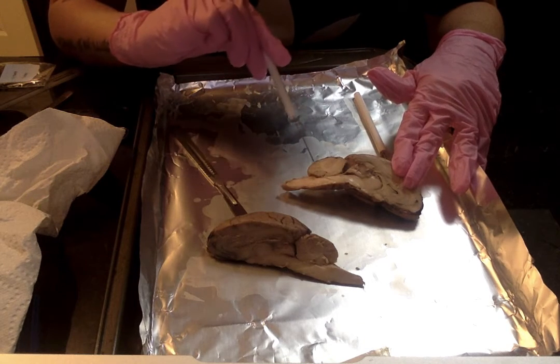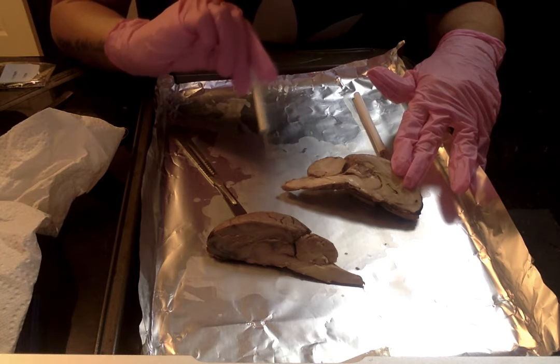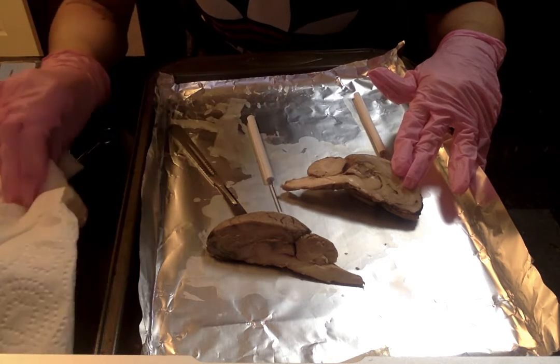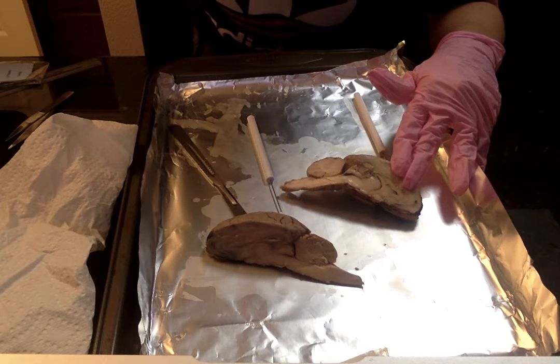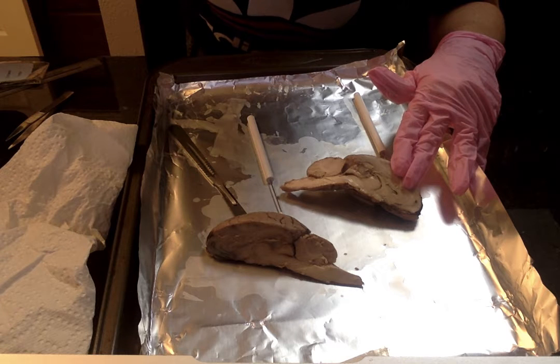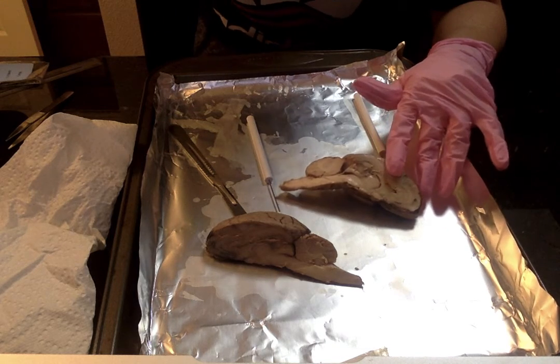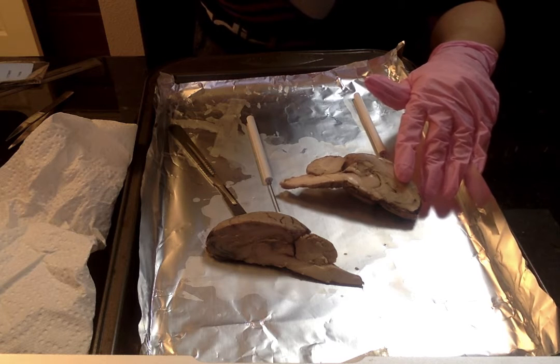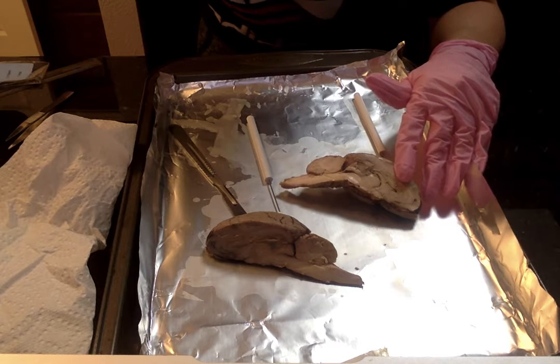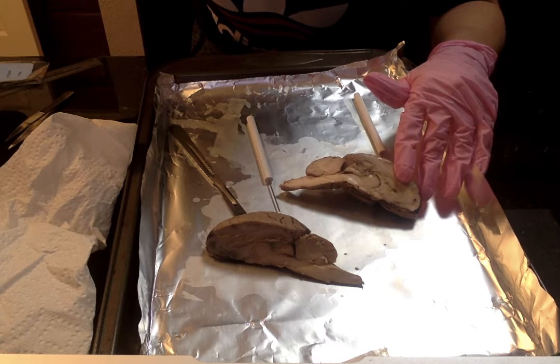The darker tissue here around the white tissue that's branching out is going to be gray matter, and the gray matter is a collection of nerve cell bodies. The gray matter includes regions of the brain involved in muscle control and sensory perception, such as seeing, hearing, memory, emotion, speech, decision making, and self-control.